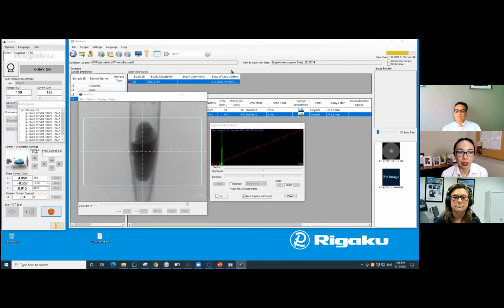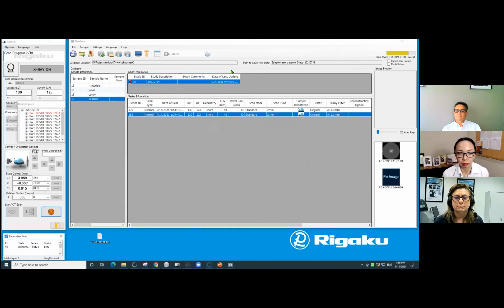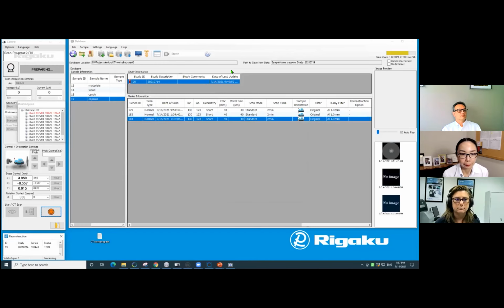And that's usually coming from not completely corrected ring artifacts. Right. But as you said, if you move the detector to kind of average out multiple pixels on the detector or to unify them, then you can get rid of most of the ring artifacts. Yeah, that's definitely an easy way to do that.